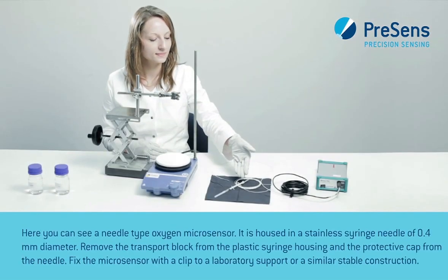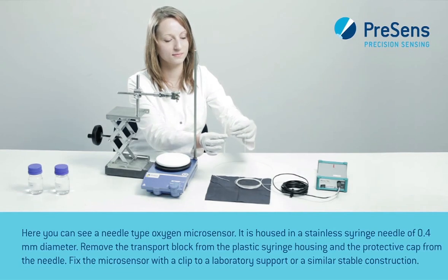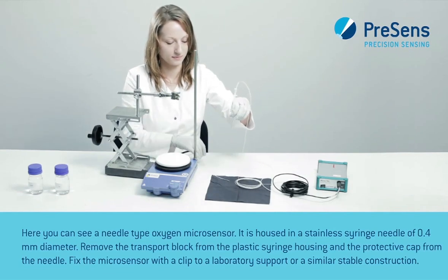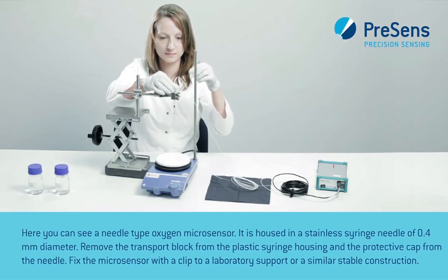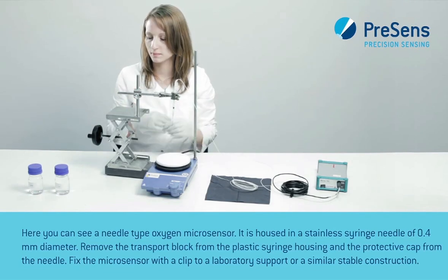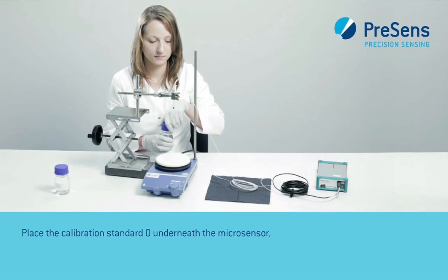Here you can see a needle type oxygen microsensor. It is housed in a stainless syringe needle of 0.4 mm diameter. Remove the transport block from the plastic syringe housing and the protective cap from the needle. Fix the microsensor with a clip to a laboratory support or a similar stable construction. Place the calibration standard 0 underneath the microsensor.